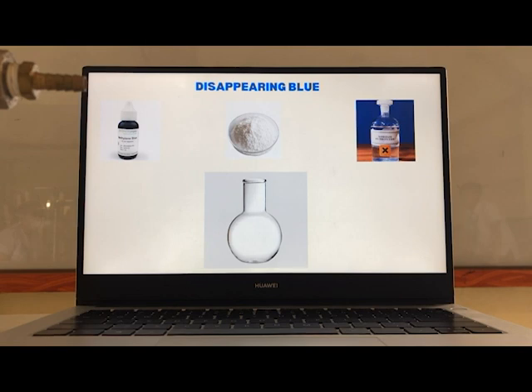In this experiment we will introduce the rules of observations and hypothesis in the scientific method. So as we go on in this experiment, we are going to observe why the blue turns transparent, then goes back to blue, the color of the liquid. The removal of the color blue is caused maybe by the glucose, but of course in our experiment we will still find out what our actual results are.